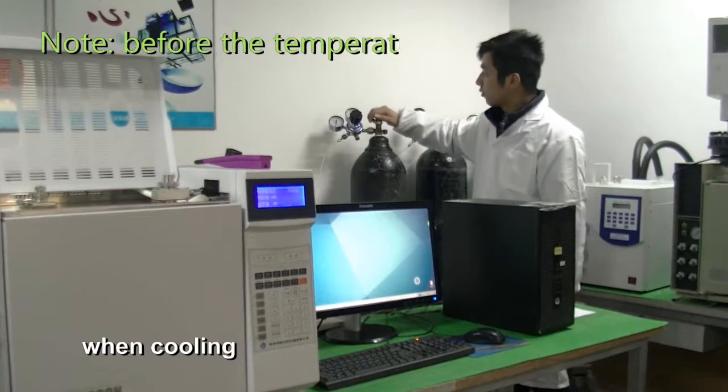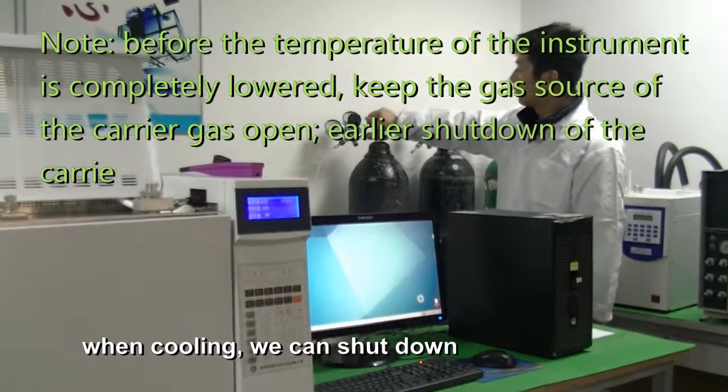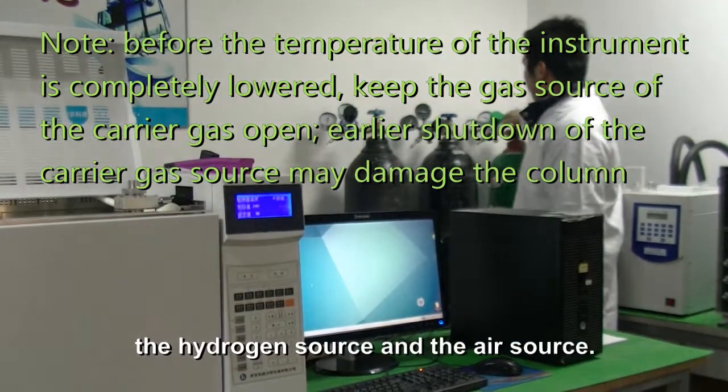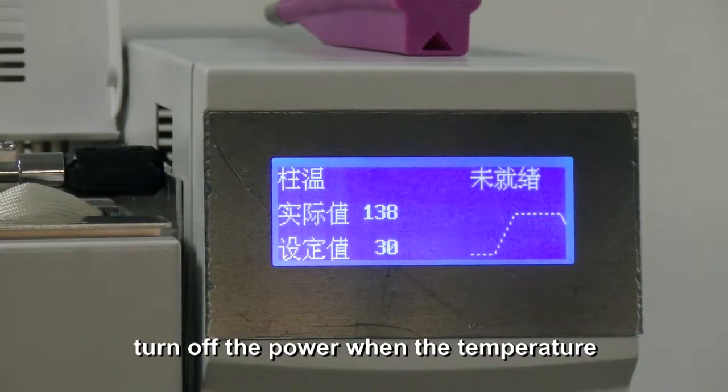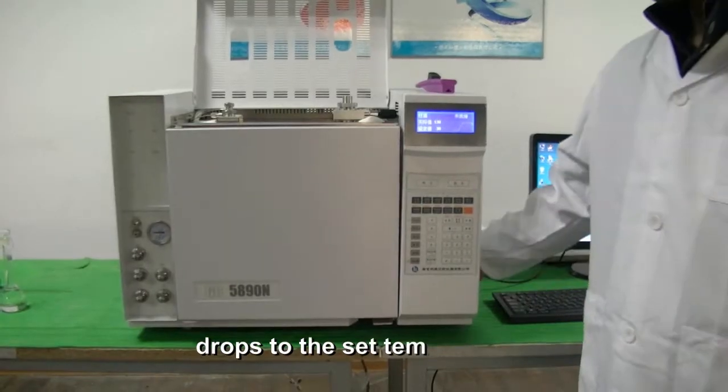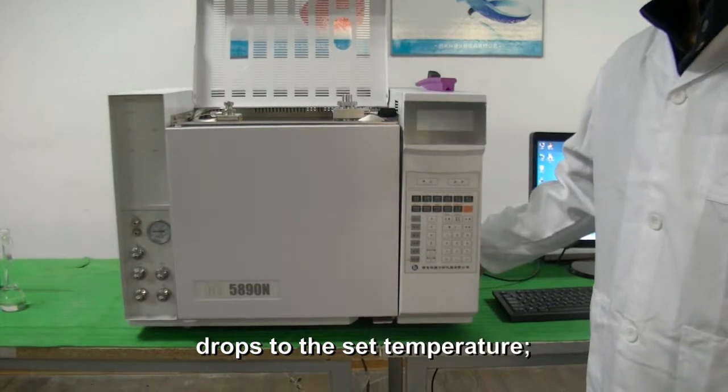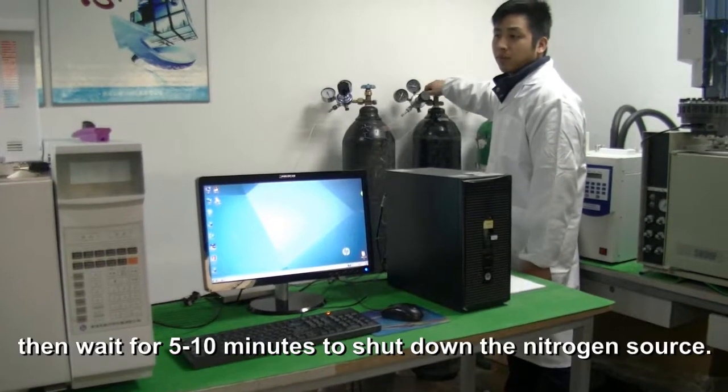When cooling, we can shut down the hydrogen source and the air source. Turn off the power when the temperature drops to the set temperature, and wait 5 to 10 minutes to shut down the nitrogen source.